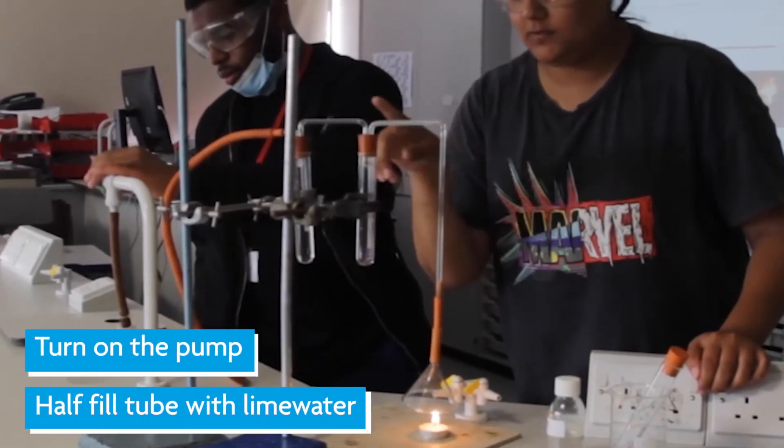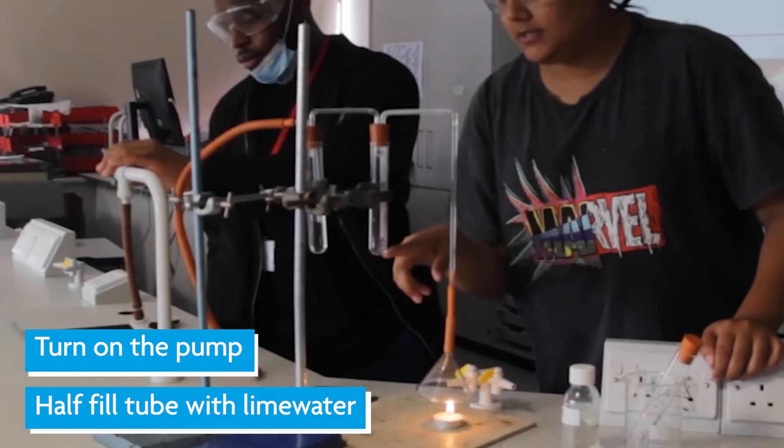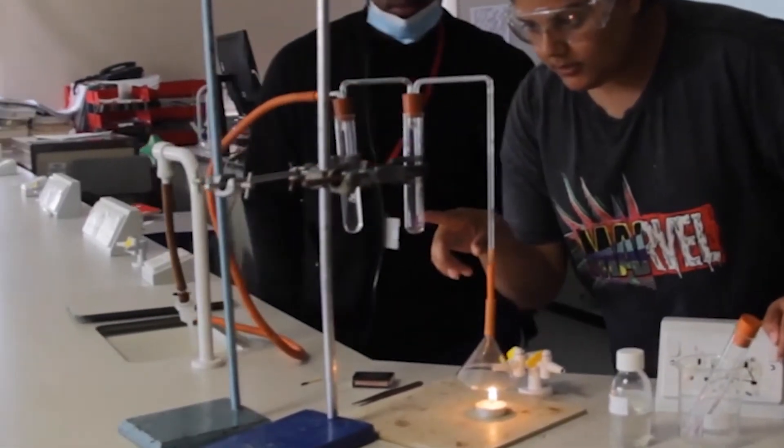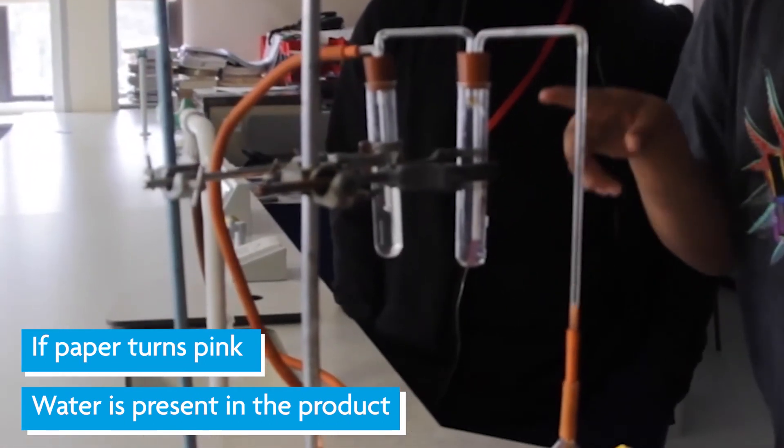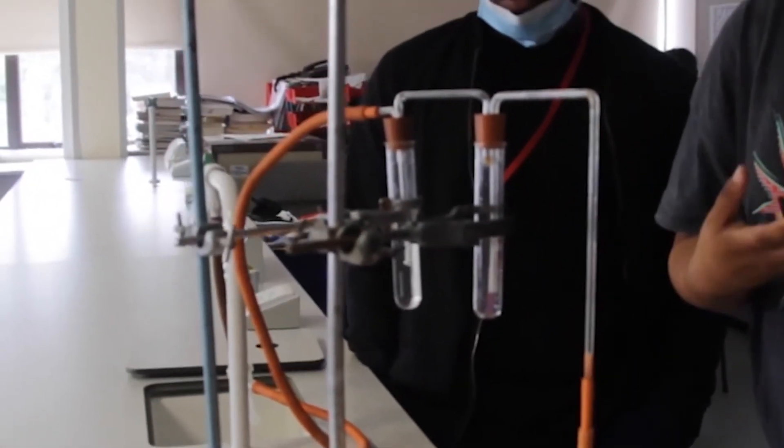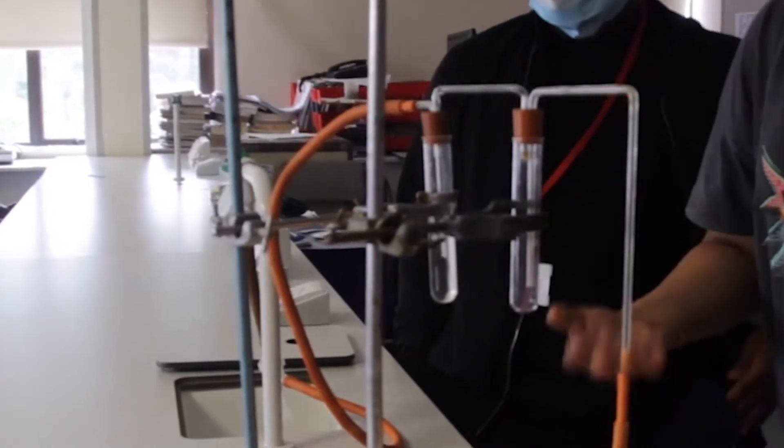When the product is released from the tube and transferred over here, the cobalt chloride will turn pink. As soon as it turns pink, you can tell that there is water present in the product.